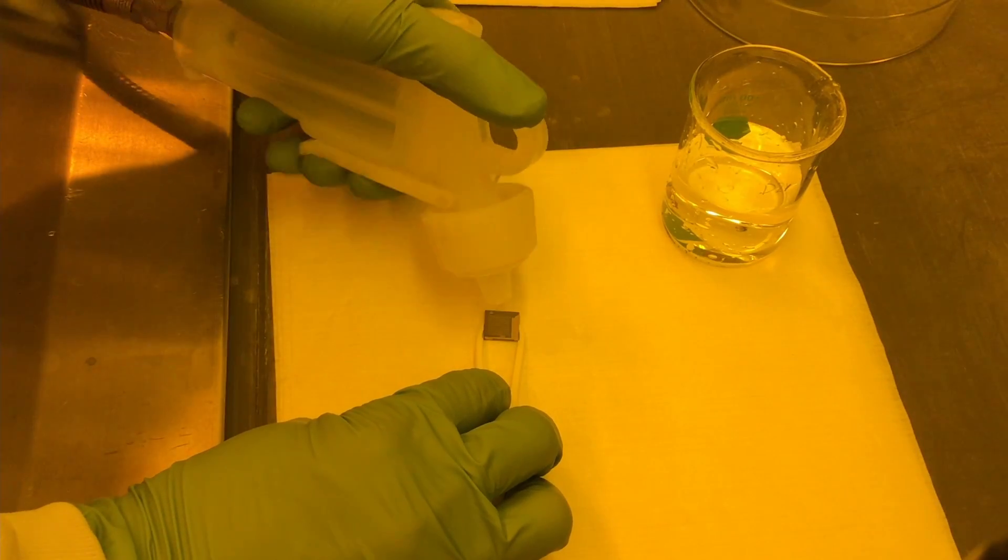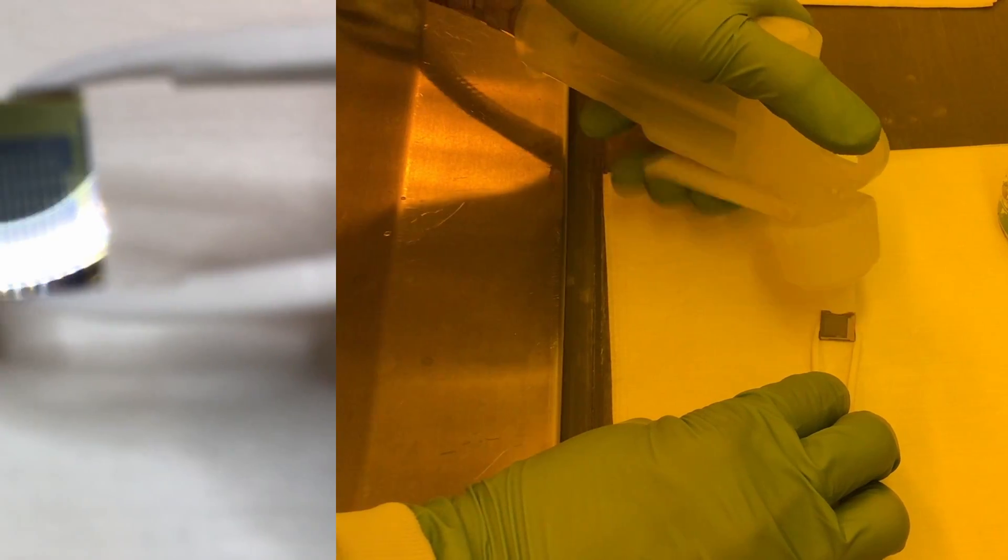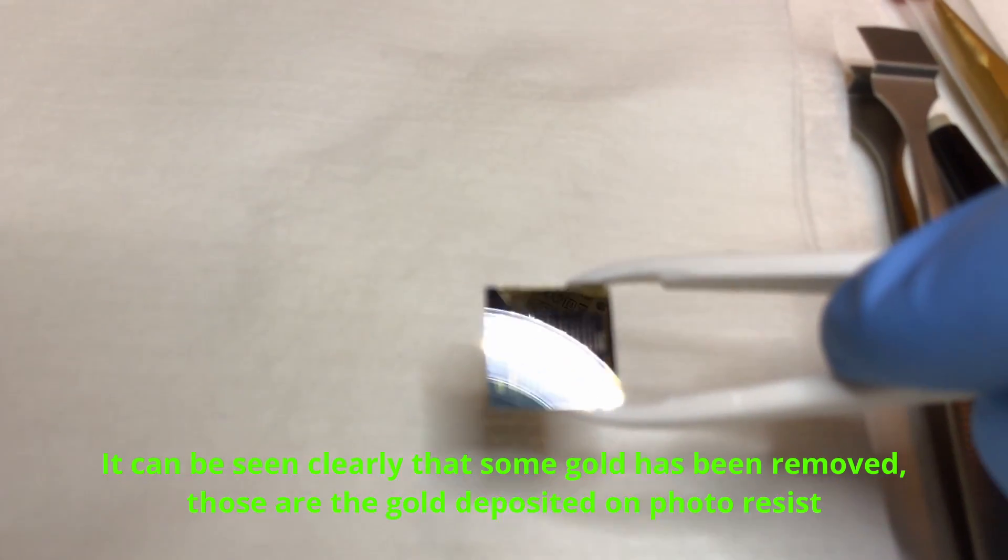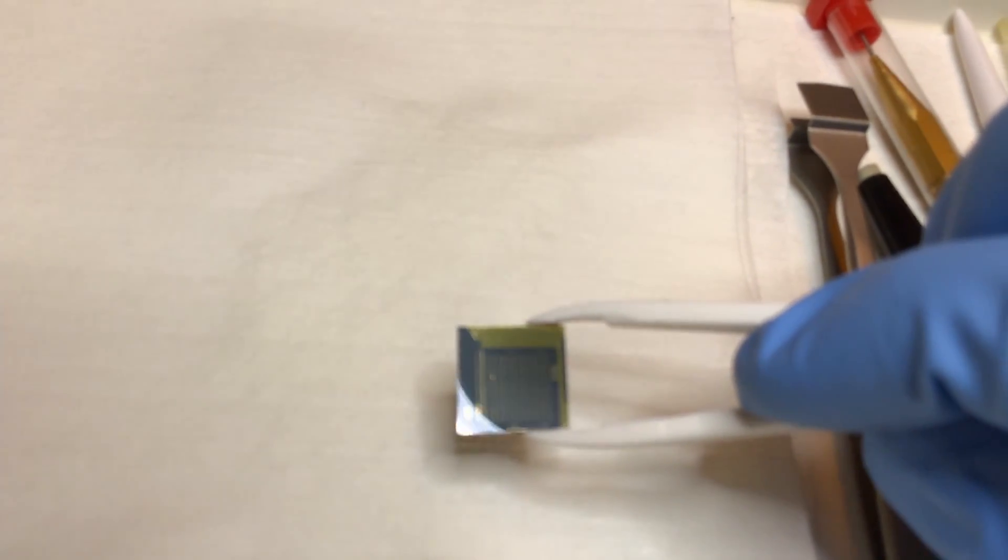Rinse the sample and dry it. Now it is very clear that the gold coated on the sample surface stays, while the gold deposited on the photoresist has been removed.